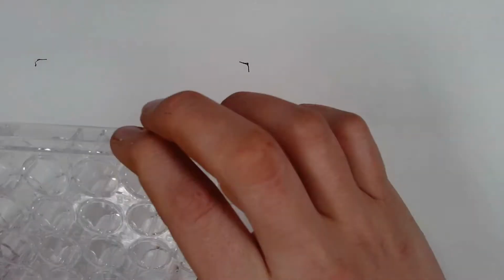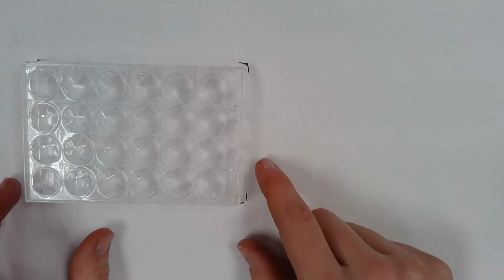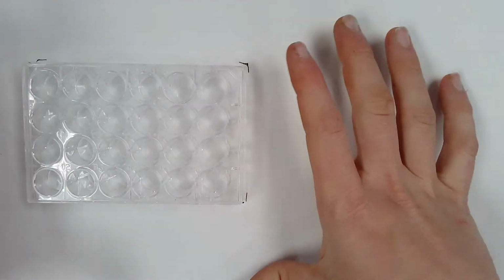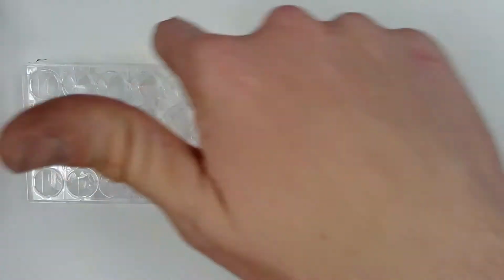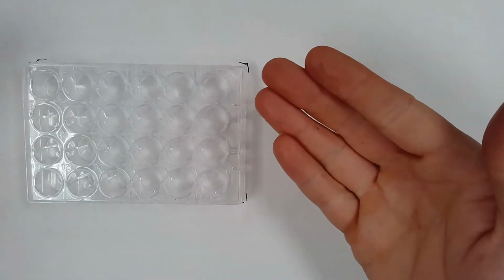So, all right, I think that's a lot better. So let's take a look at this for a second. This is a specialized piece of lab equipment called a well plate. Well, semi-specialized. I mean, you'll find them in most labs. And it's designed to make reactions happen in a small space where I can kind of work like a spreadsheet, right? It's also nice because I don't need a lot of chemicals to use this and check it.